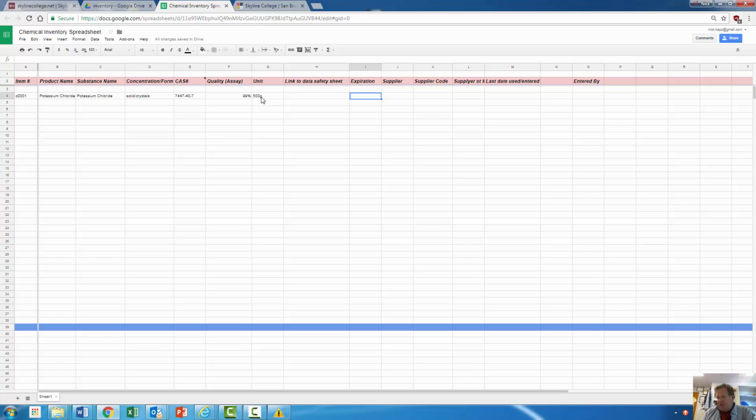In terms of expiration, it's a salt, and sometimes they don't have it, especially if this is a little bit older. And so repack after 5 years, bottle becomes brittle. And so the expiration date is N/A. The supplier is basically EM Science. That's an affiliate of Merck, but I will put that there.